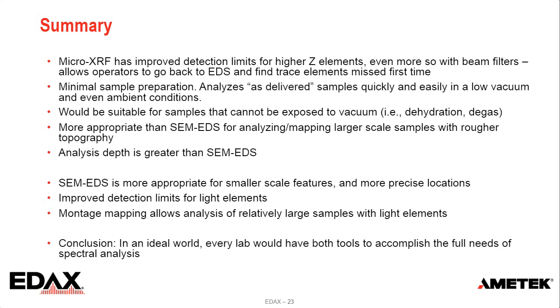Therefore, the process is efficient at creating low energy X-rays above the absorption edges of low energy elements such as carbon, oxygen, nitrogen, and so on. Another reason is the EDS detector uses a silicon nitride window to improve the X-ray transmissivity in the low energy range.